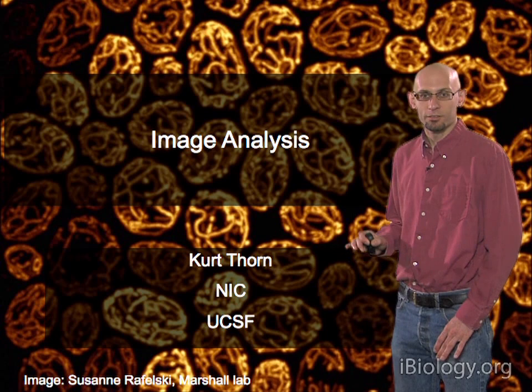Here we're doing the same thing, but now biasing a little to be more centered around the pixel vertically. Take more information from the vertical pixel in the center there and not the ones to the left and the right. What these are going to do is enhance edges that run horizontally through our image. In fact, if we apply the top filter to this image, here's what you get. You see that these actin filaments running roughly horizontal jump right out. The ones running vertical are totally suppressed, and the ones running at a diagonal show up somewhat.